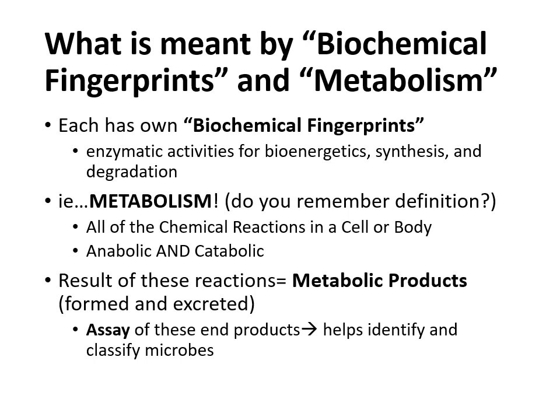So that's what we mean by biochemical fingerprints. That yellow change in the media is the fingerprint of those organisms. Now, when we say enzymatic activities and looking for end products, we're dealing with metabolism again, and I want you guys to circle, star, highlight metabolism.